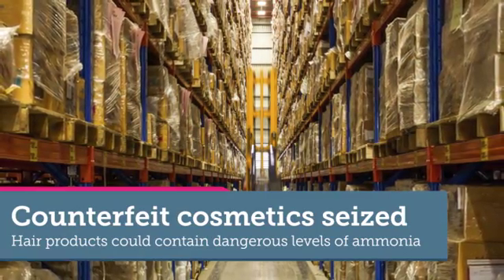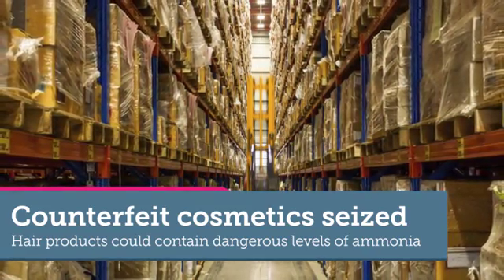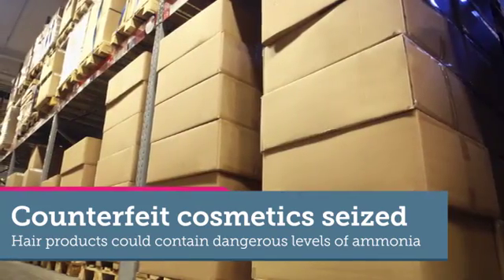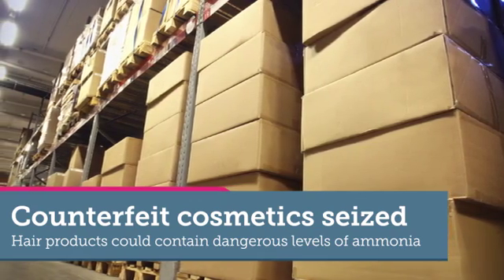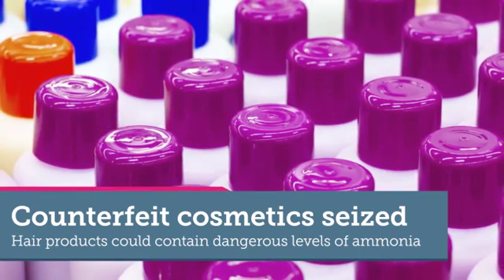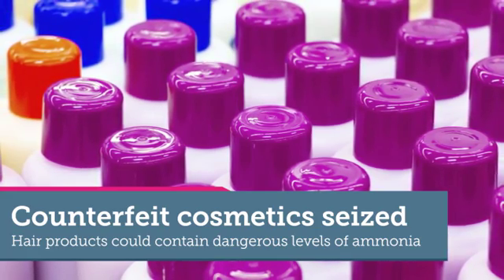Trading standards have confiscated a suspected counterfeit consignment of hair products. Enforcement officers are concerned that the products might be harmful if the ammonia content is above safety standard levels. A sample bottle has been sent to the trading standards testing laboratories for analysis to determine the exact amount of ammonia in the product.